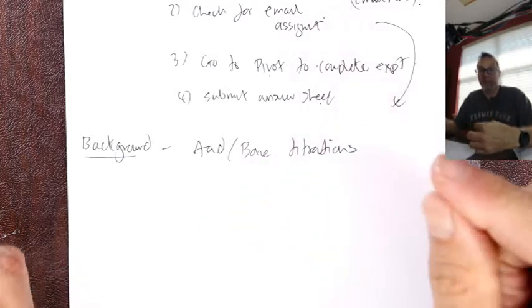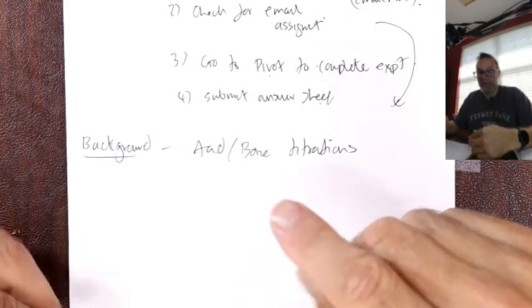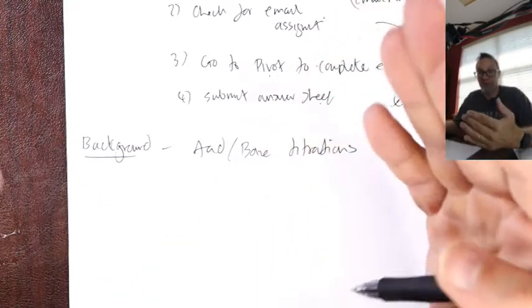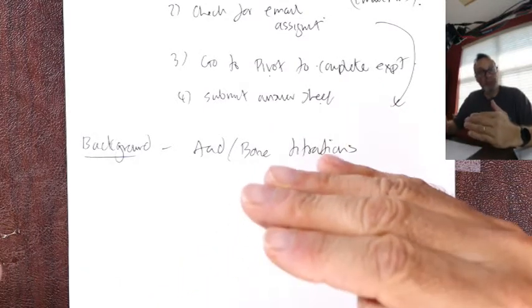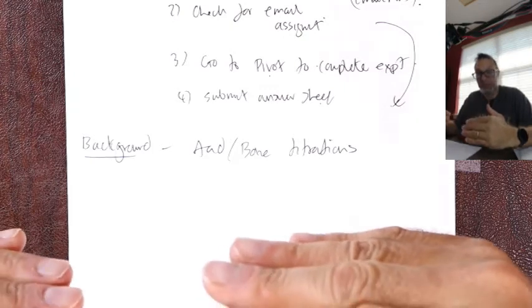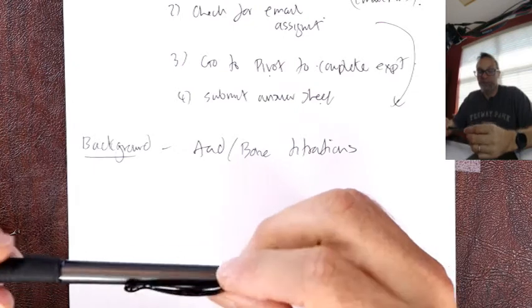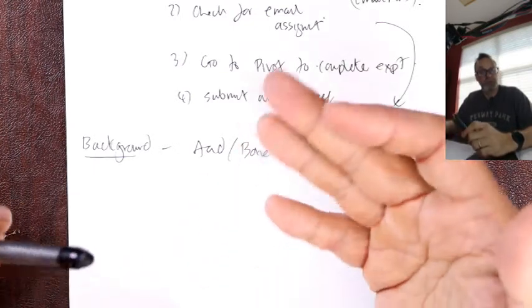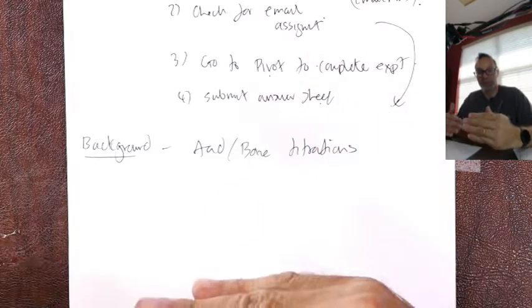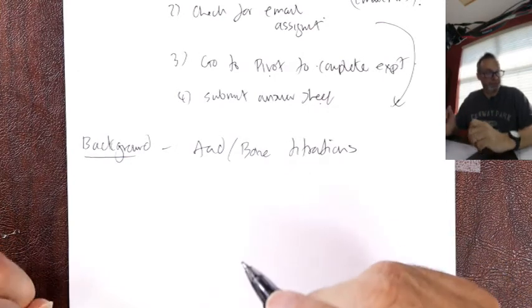So you add exactly the right ratio of typically base to acid, as you would in this experiment. And right when they're stoichiometrically equivalent, so it's 1 to 1, whatever the stoichiometric balancing numbers are, when it's exactly 1 mole and 1 mole being combined, or whatever the number of moles is, just has to be equal, the solution will change color. There are indicators out there, we'll get into it, that change color when solutions become neutral. Indicators are chemicals that are one color in acid, one color in base. When they switch, you see a color change, right? And that's when they're exactly equal. Maybe you've done a titration in high school.